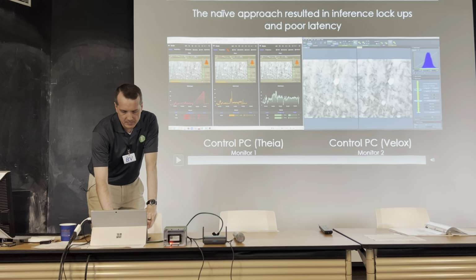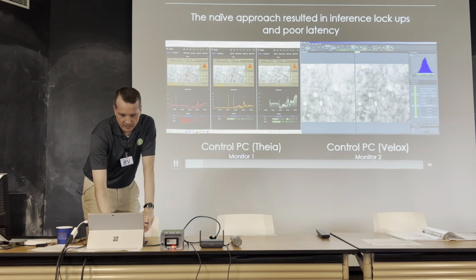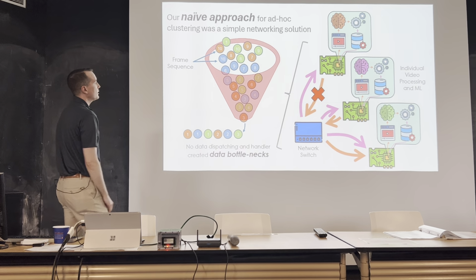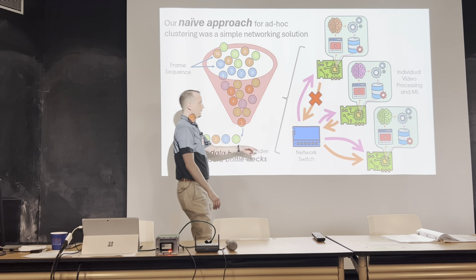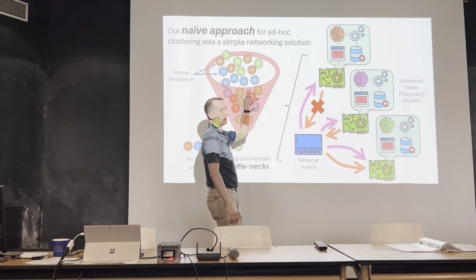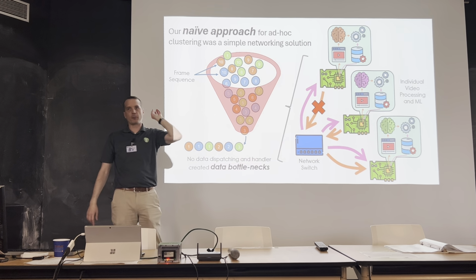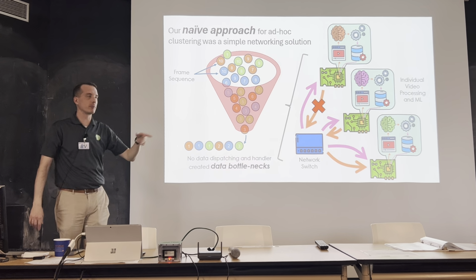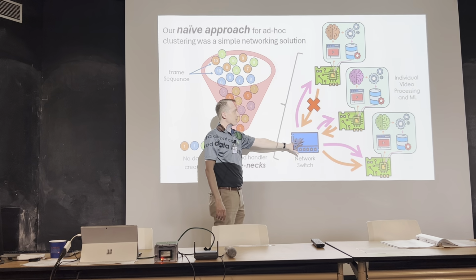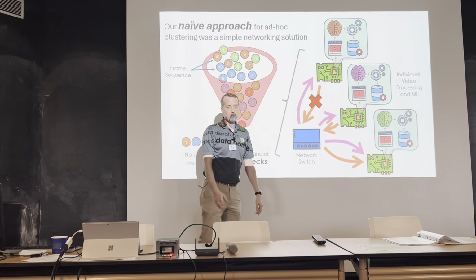And ultimately that was because of our naive initial approach, right? The issue was that we had 3 separate acquisitions going on, and you're sending that one image from that one system 3 times across the system, all on your gigabit switch, and even that wasn't enough.